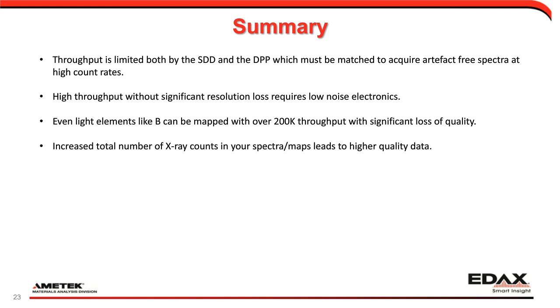So the quality of your data set depends on both the detector resolution and the number of counts in there. Having good resolution with low count numbers doesn't give you anything. Having high count rates but with bad resolution is not good either. They need to be balanced out, and this is what we're able to do. So you can do fast acquisitions, high statistics in a short amount of time, and build up your spectra to give high quality data.